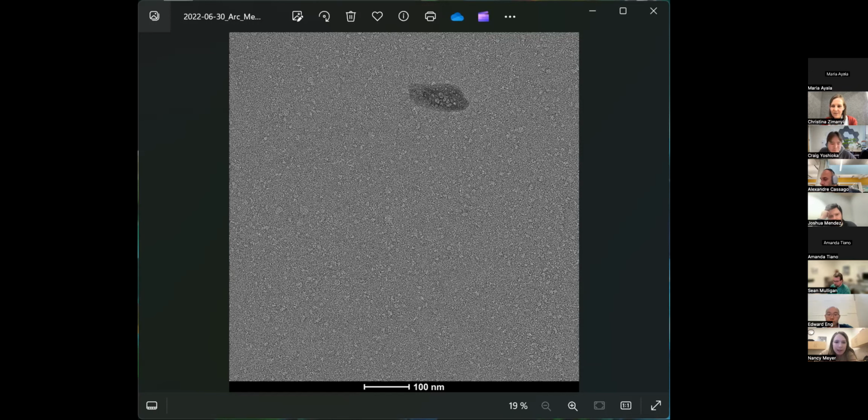I see a variety of sized things in here. Do you see your protein in here, and do you get reasonable 2D classes, albeit in one orientation? We get 2D classes, but while making the 3D reconstruction, we can't do it because of this preferred orientation problem. And the maximum we can go is like 4.5 to 5 angstrom, but not more than that.